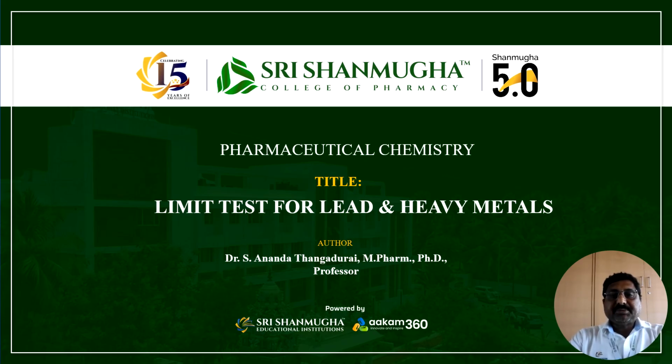Now let us discuss limit test for lead first. Lead is a toxic heavy metal impurity and even a small amount can be harmful. Lead may enter drugs through reagents, water, glass containers, or manufacturing equipment. Therefore, pharmacopoeia prescribes a limit test to ensure that lead is within the permissible limit.